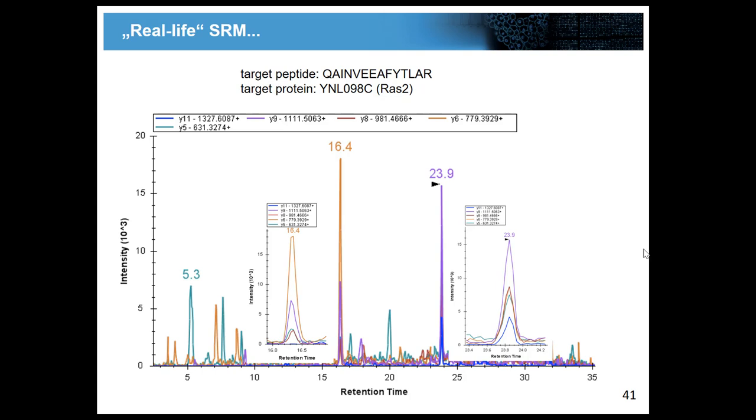But still, even then, I wouldn't publish. I wouldn't publish a paper where I say, I'm sure it's this one. Just by looking at coelution, peak shape, and intensity, it's very risky to do that. So we need more information, and we said it.